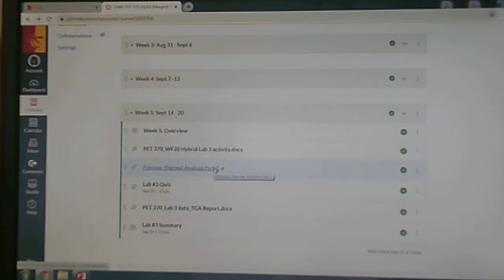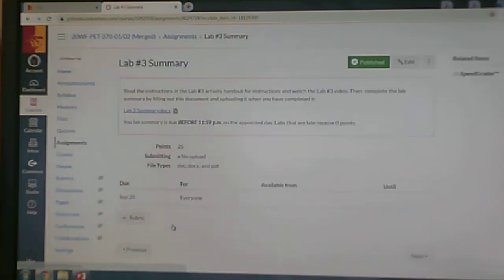Now in the first one where we did DSC, we had a background on thermal analysis and then DSC in the second video. I'm just asking that you look at the second video in this series, because this is where the TGA analysis is covered for polymer thermal analysis. So please watch this video, look at your lab activity, and then do lab quiz number 3. After you've looked over your data, please complete your summary.